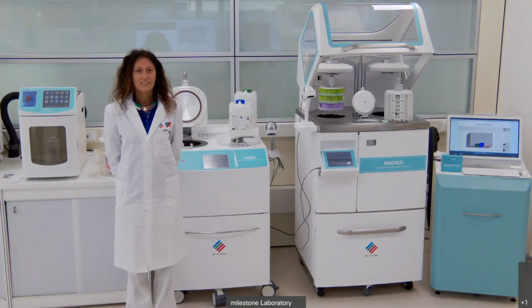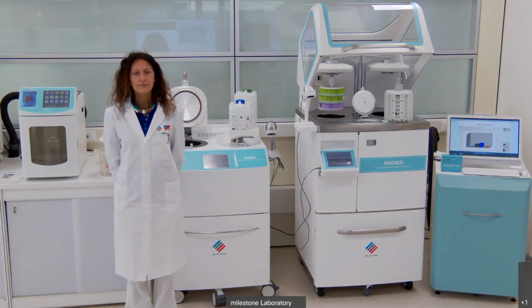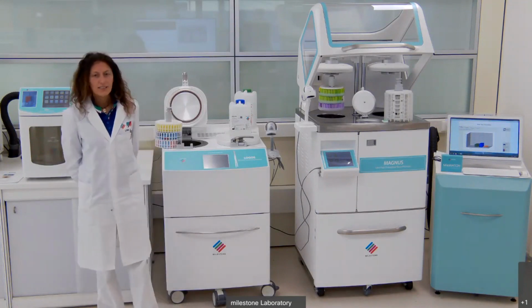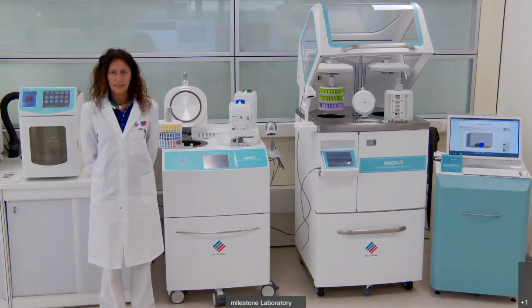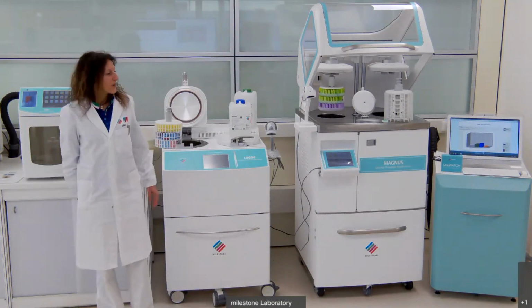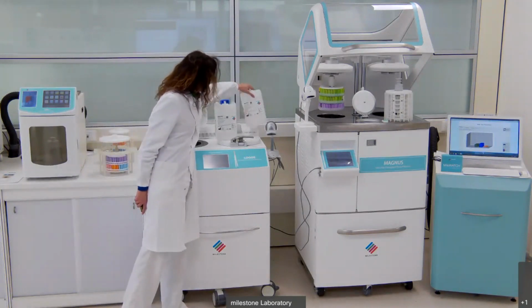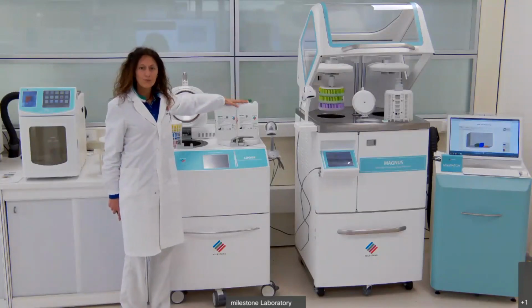So first question for you, Lisa. There is a user who says, I would like to avoid the use of xylene in my laboratory. What would you suggest as a substitute? As a substitute, isopropanol is the common substitute of xylene. It's green and safe. But another suggestion is our reagents, Mile1 and Mile2.